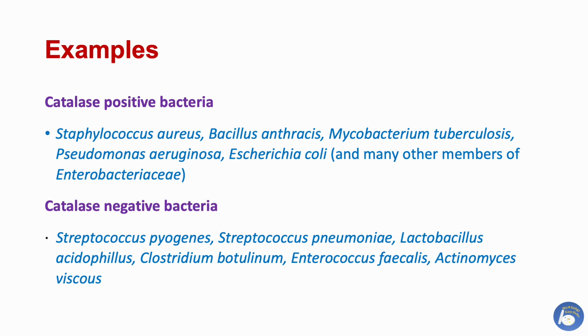Examples. Catalase positive bacteria are Staphylococcus aureus, Bacillus anthracis, Mycobacterium tuberculosis, Pseudomonas aeruginosa, and E. coli, etc. Catalase negative bacteria are Streptococcus pyogenes, Streptococcus pneumoniae, Lactobacillus acidophilus, Clostridium botulinum, Enterococcus faecalis, and Actinomyces viscosus, etc.